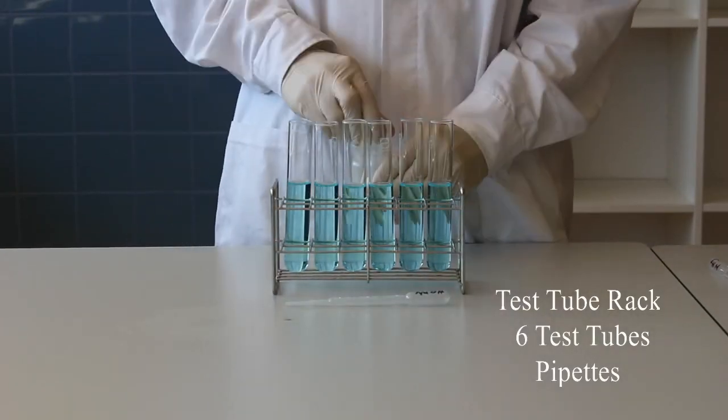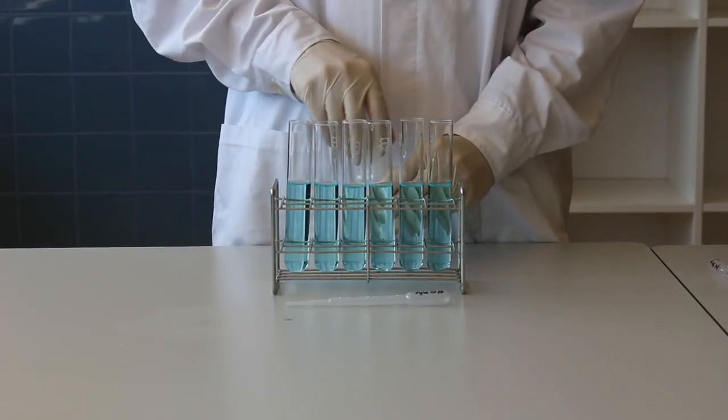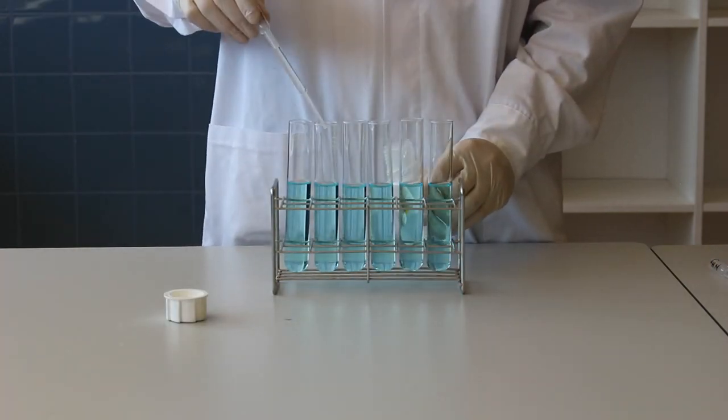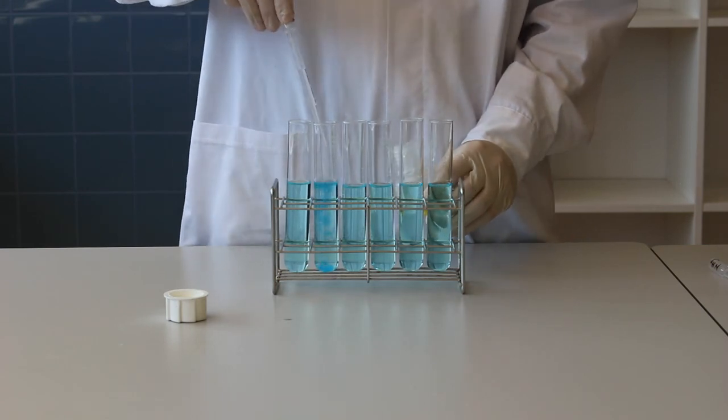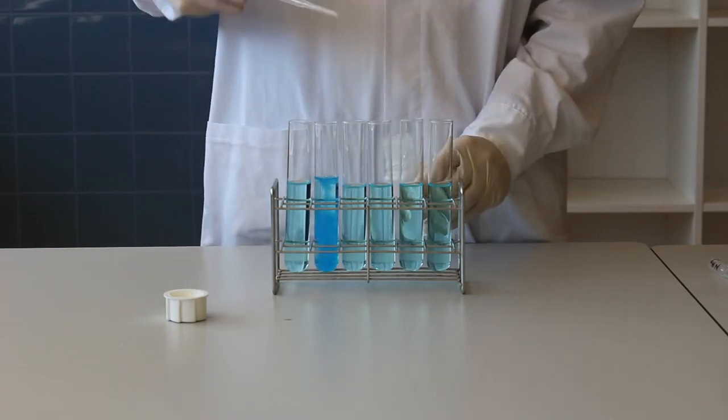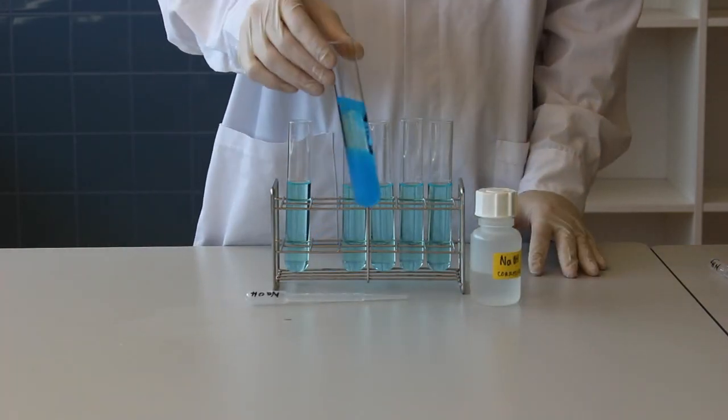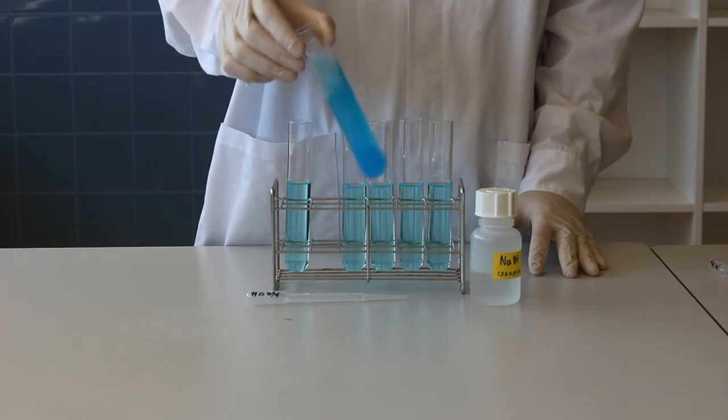And now we add sodium hydroxide. The hydroxide ions are going to remove the hydrogen ions from the water ligands. And once hydrogen ions have been removed from two of the water molecules, you are left with a neutral complex. This will form a precipitate. The precipitate formed by the addition of sodium hydroxide will be light blue.